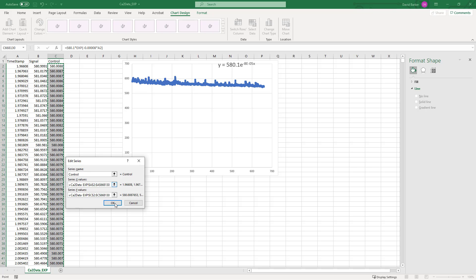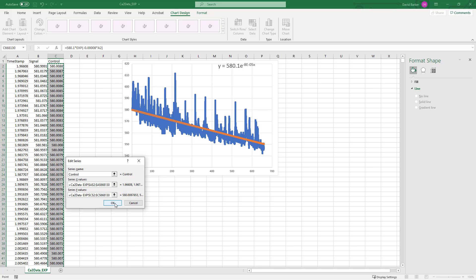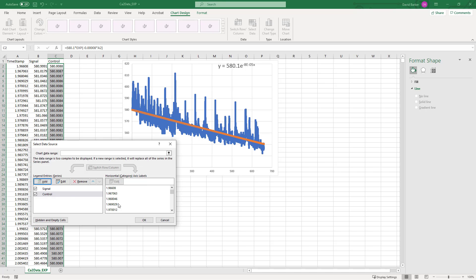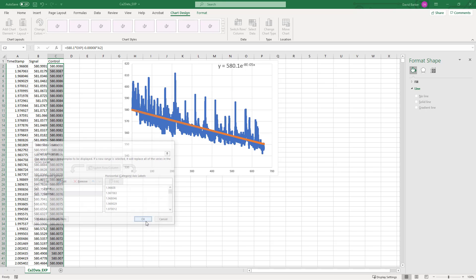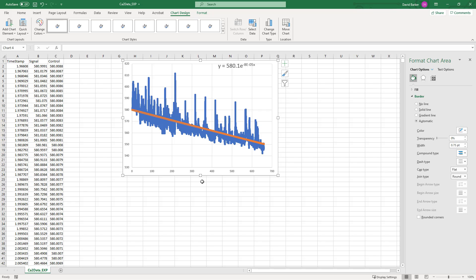Our X values are going to be our timestamp column here, and then our Y values are going to be our control channel here. Then we can hit OK. The way that I'm getting this to go from bottom to top very quickly is to use combination of keys Shift-End and up or Shift-End and down, but you can just as easily drag. Once that's done you can hit OK.